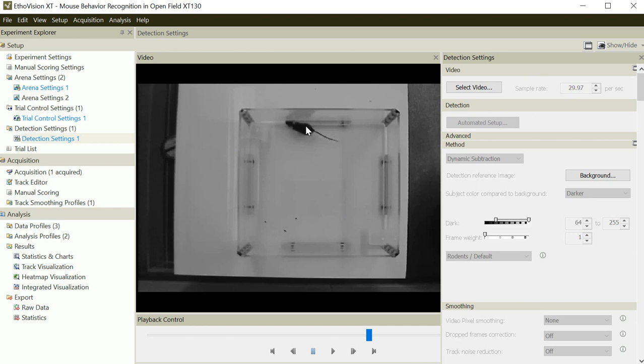And also it would be advisable that you take care of the lighting condition. Here you have the reflection of the light which may be on the ceiling, and this kind of reflection will corrupt the video condition. So you should avoid this kind of interference. One idea is to use indirect lighting, which is something like that.